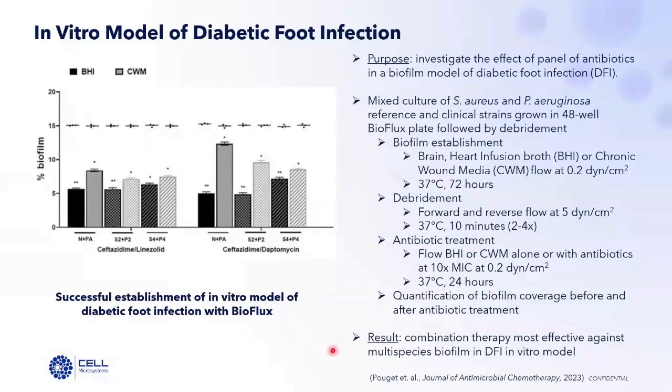The results reveal that debridement alone is not a perfect treatment because it doesn't eliminate biofilms entirely. However, adding antibiotic combination therapy to treatment was effective at further decreasing the amount of biofilm coverage in this in vitro model of the diabetic foot infection.